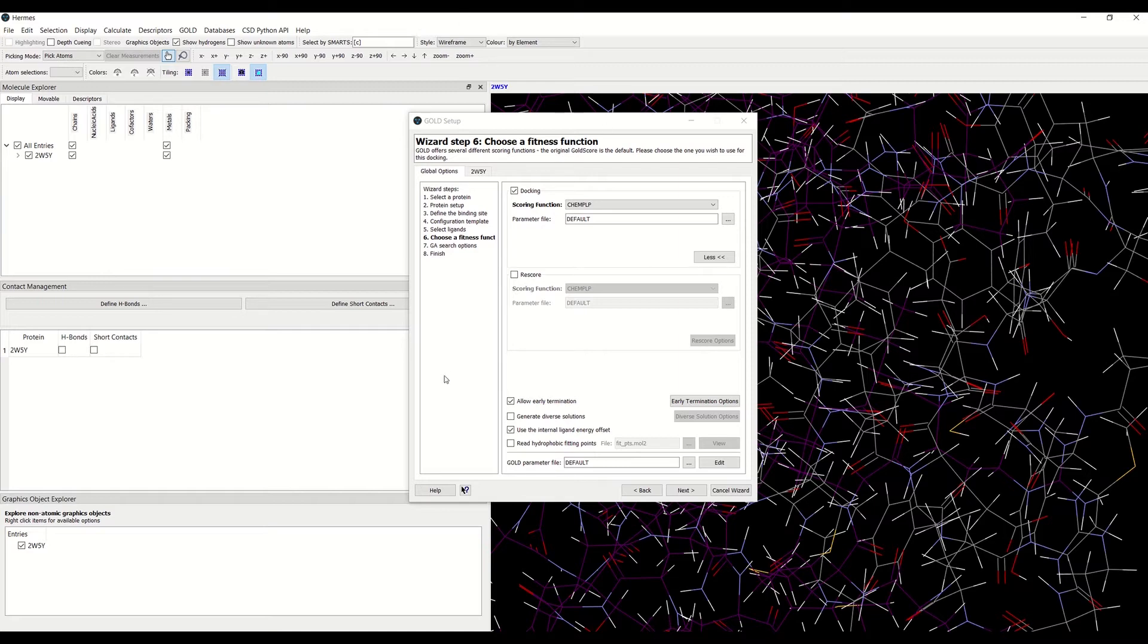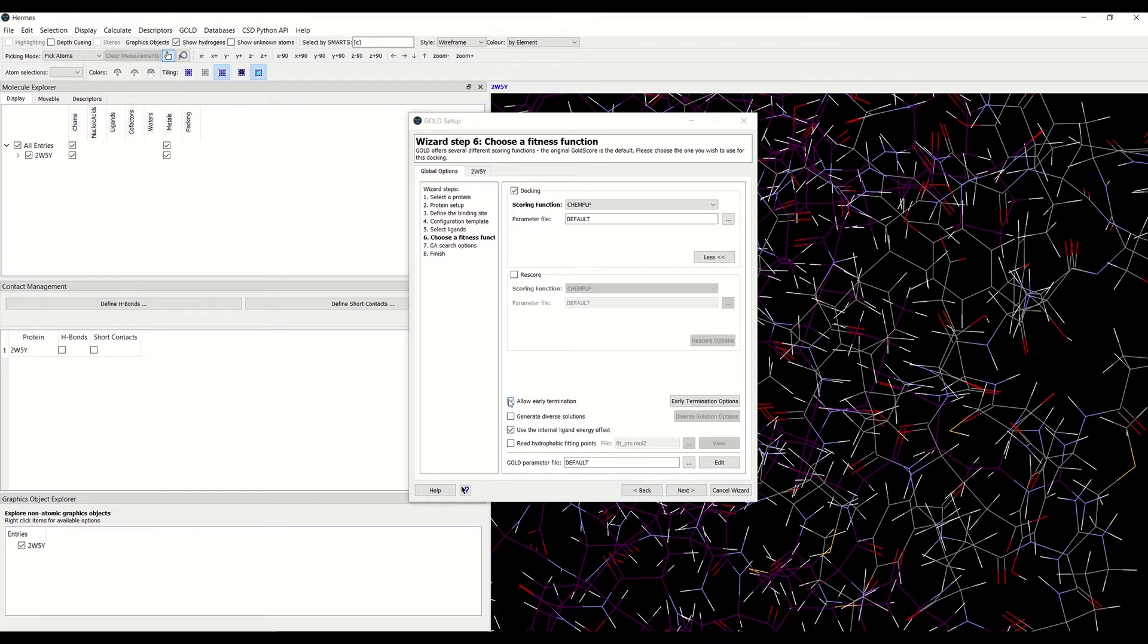You can enable the allow early termination option by checking the tick box here in the choose a fitness function tab in the wizard. Then you can specify the early termination options.